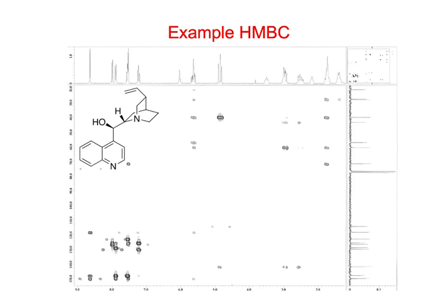Let's look at, say, this peak here. We said that that one was here. This one does have some multiple bond correlations here, but notice these signals right there, and they don't actually match up to anything here.